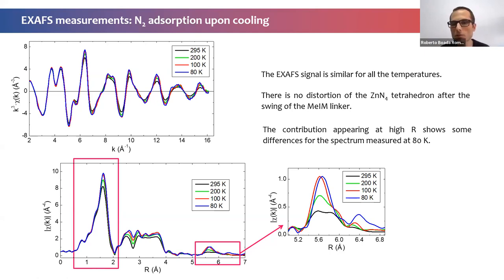There are too many contributions, too many multiple scattering contributions that can add to this spectra, to fit in this spectra. So we were careful not to have too many degrees of freedom. I don't know what you mean. I hope you got me on that. So I would not be able to tell you if this is a thing. It's just kind of simply the way it gets from the XAS, okay, when we do the Fourier transform.